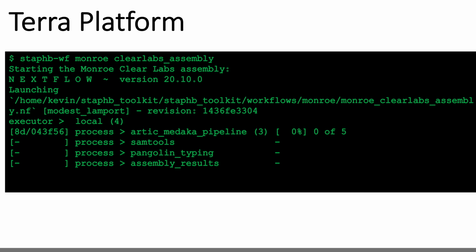So what would typically happen is I'd write a tool and be so excited that things worked. And then I'd start to walk someone through how to use it, and I'd show them a screen like this. And there's a certain percentage of our public health community that sees something like this and get pumped. And they get excited to learn about how to start using these new technologies and want to start learning command line and interacting with things exactly like this. But unfortunately for most public health scientists, this is a brick wall.